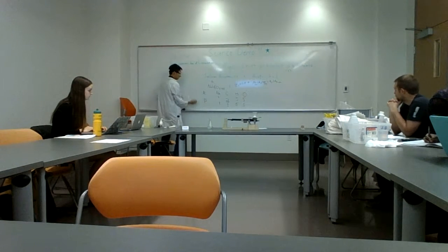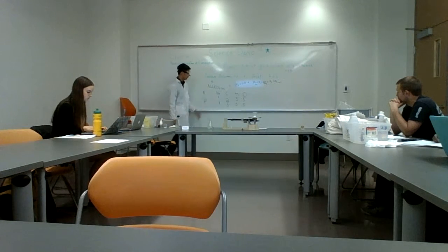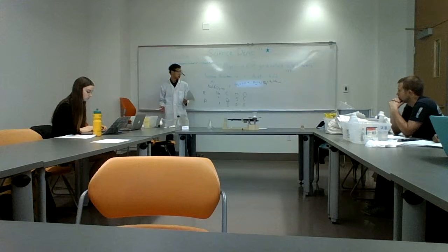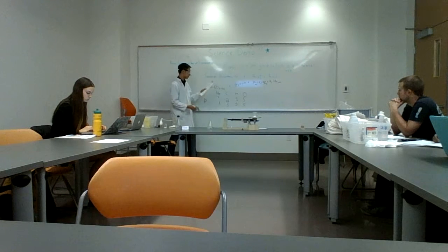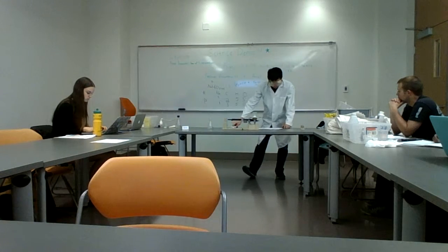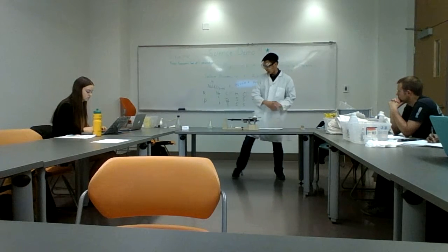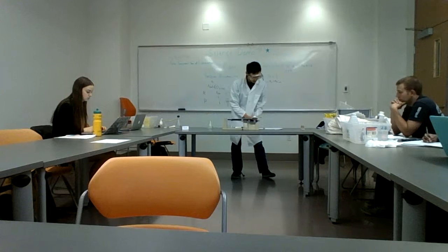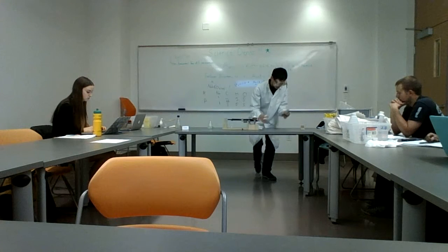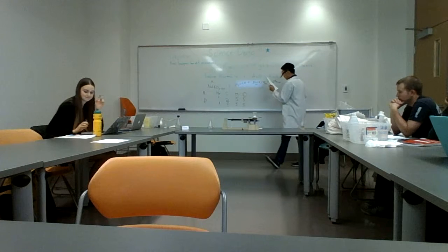By judging this, the number of reactant atoms and the number of product atoms are now all equal. The sodium, carbon, hydrogen, and oxygen are all equal, and so the chemical equation is balanced. There's no need to add any additional numbers here. So we verified the chemical equation is balanced, there's nothing to change. We also made sure that we have the same amount: 5 grams of sodium bicarbonate and 100 milliliters of acetic acid. I'm going to record down some numbers just to make sure that we are all on the same page. On your worksheet, write down the objects that we have.